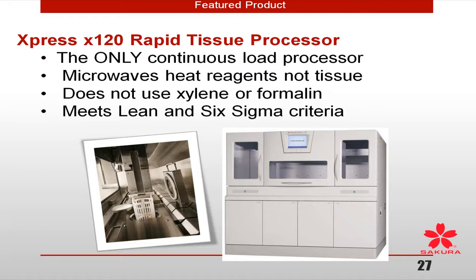I'm a big proponent, and that's why I like a continuous load processor. It doesn't matter whether I've already started 20 or 40 cassettes. The most waiting time I'll have is 20 minutes to load those breast samples.